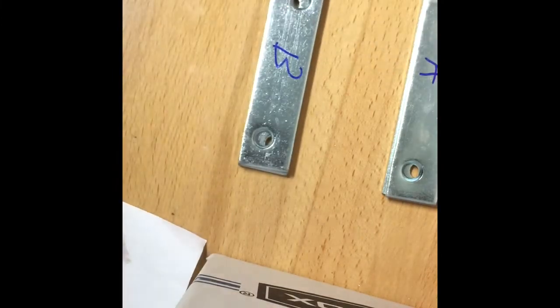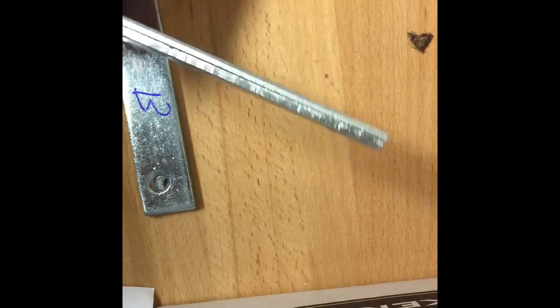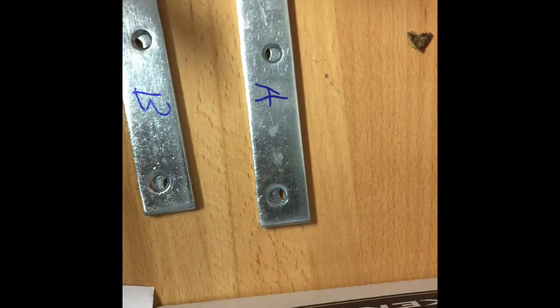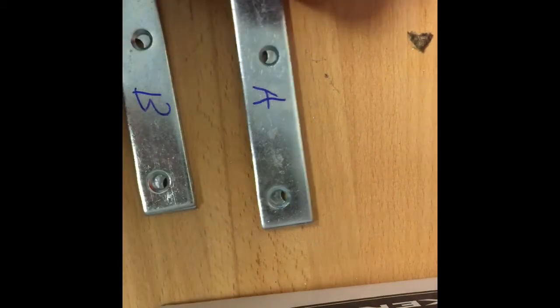Now, in the last section of this video, we come to our moment of truth. We have our samples A, B, and C. A was conducted with a 3-3 balance of epoxy and resin: 3 drops or portions of the diamine hardener and 3 portions of the resin.